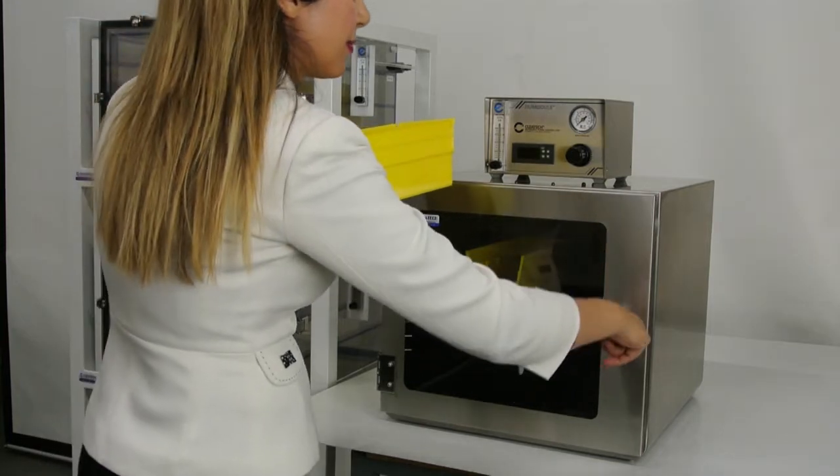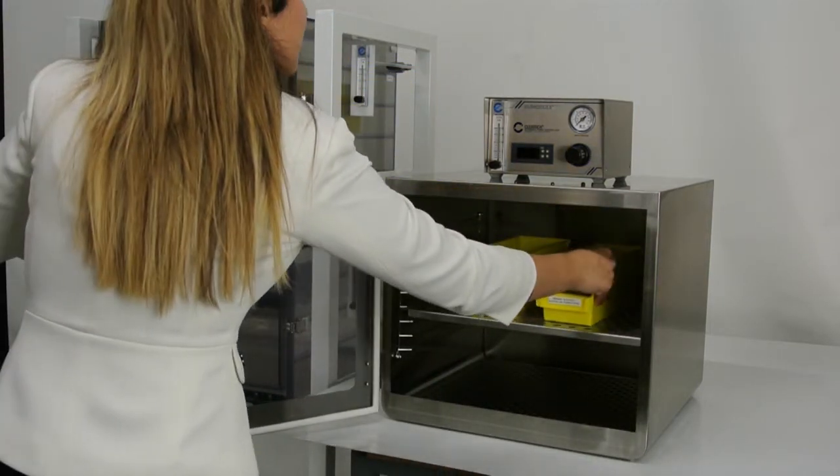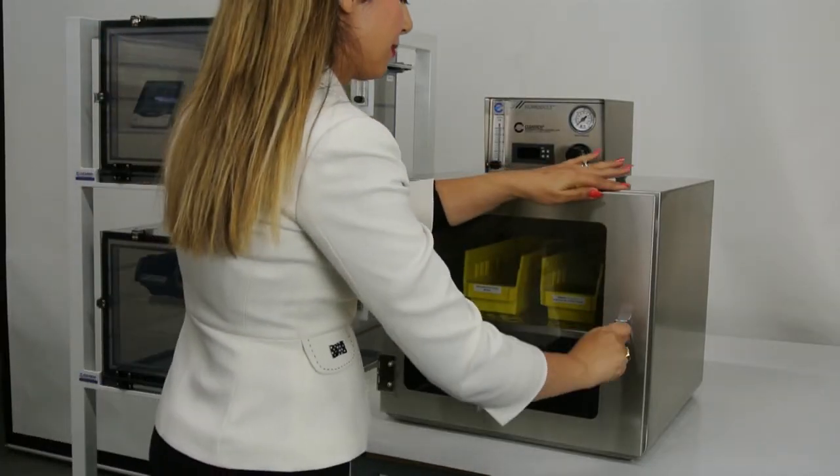Electro-polished stainless steel offers a highly reflective and smooth finish to prevent contaminant buildup, and is easy to clean since it can hold up to corrosive cleaning agents.